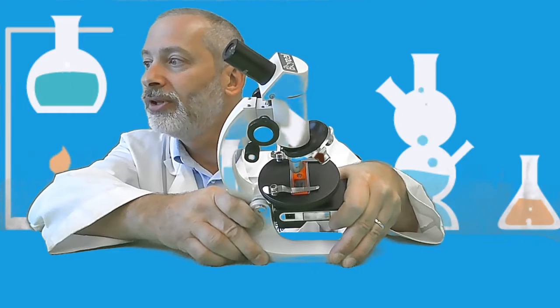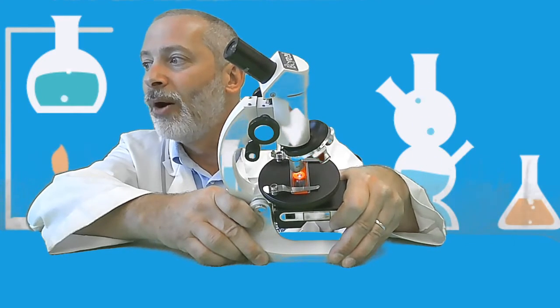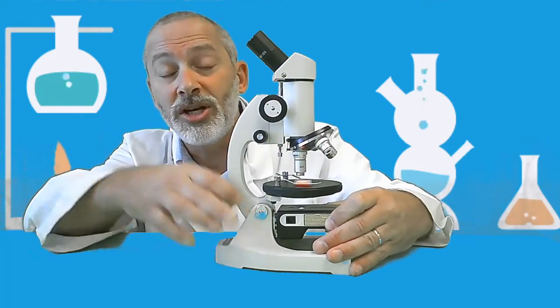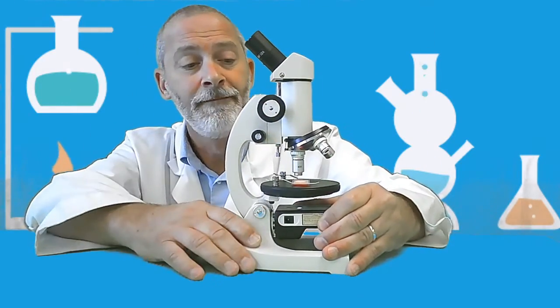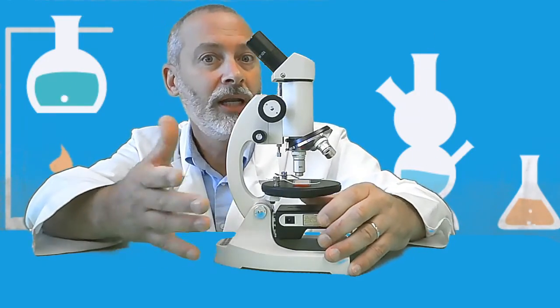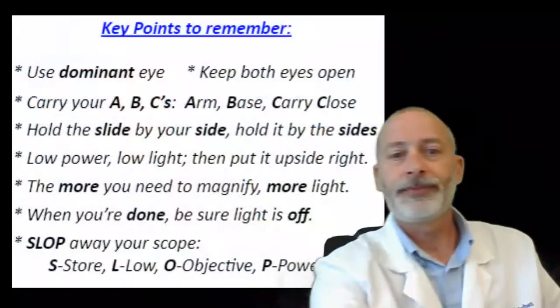You start with low power, low light. As you go up to high power, you have to add more light because you're getting to a much smaller area. And so in order to see your specimen, you'll have to have more light. That's all that means.